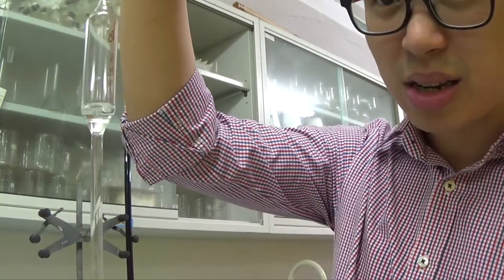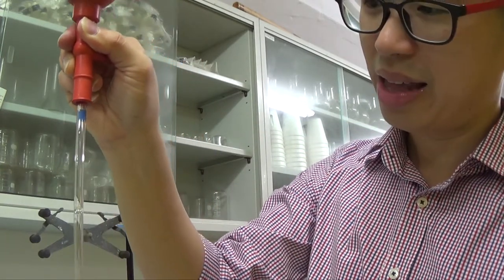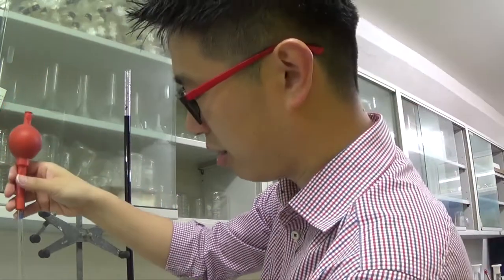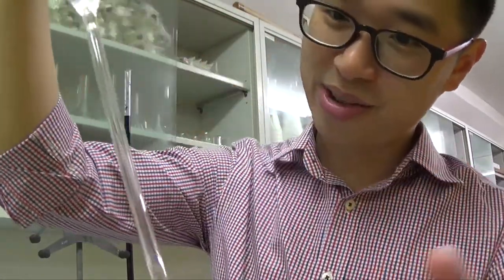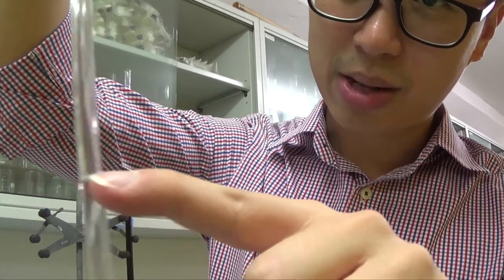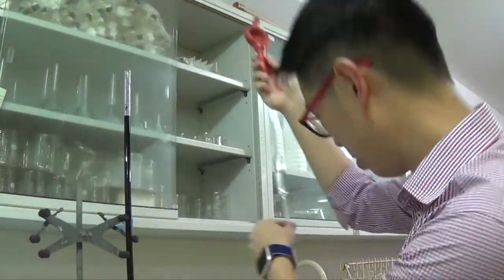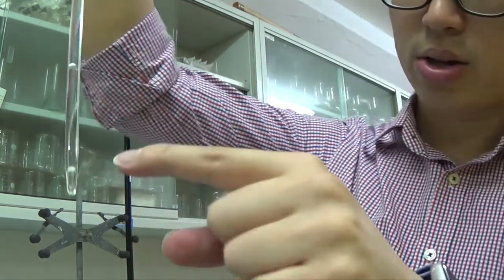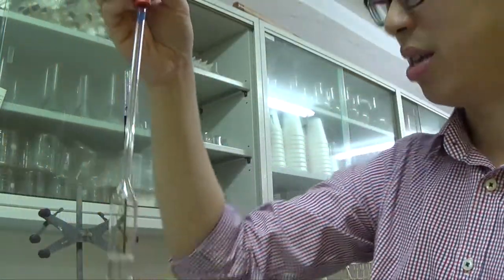So as you could see, the thing is slowly filling up. I keep on pressing S, I hold S, and that is not great because they have just been filled with air bubbles, and this one is no longer compressed. So I will just press A, and this is not great as well because you could see I clearly have not done titration for a long time, and there's an air bubble from there all the way to there. So I'll eject this a little bit. Now this is all filled, a little bit of air bubbles here and there, but at least that's better than the one just now.